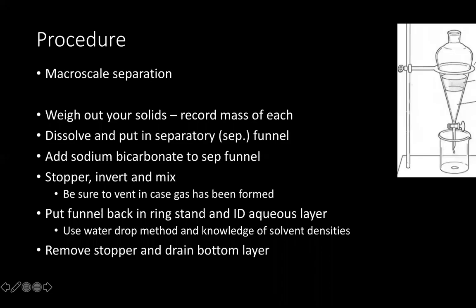This week's lab we're doing a separation on the macro scale. You can see an illustration of what a separation setup looks like with a separatory funnel, often called a sep funnel, and a beaker for collecting one of your layers.